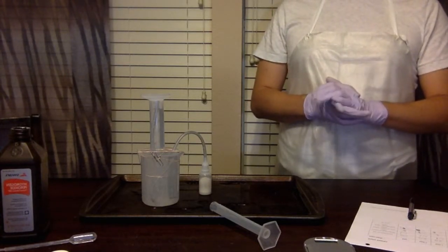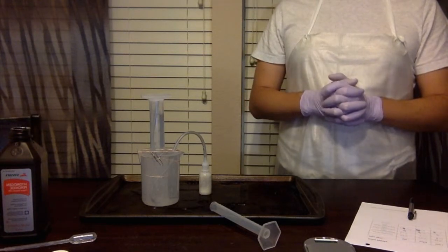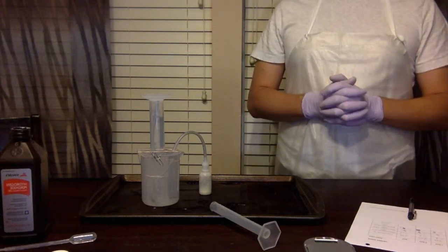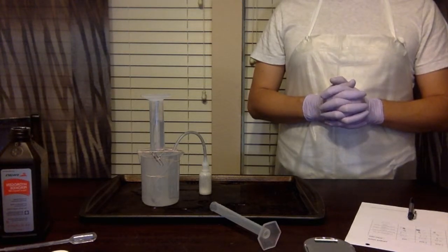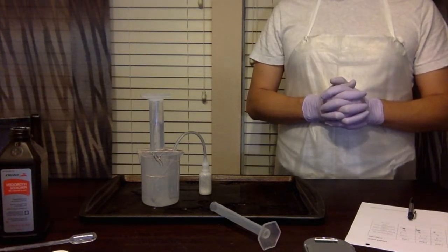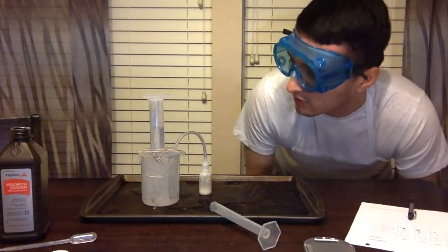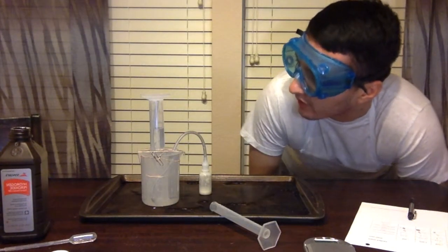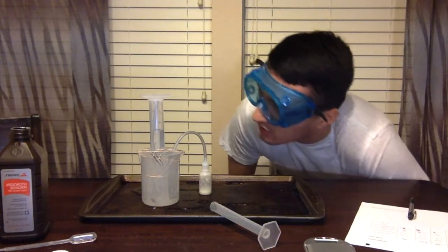It looks like we're getting a rapid production of O2. Looks like we just passed the 10 milliliter mark. 15 milliliter mark. 20 milliliter mark. We're getting some spillage of water as it's being pushed out of the graduated cylinder. 24 milliliters. 25 milliliters.